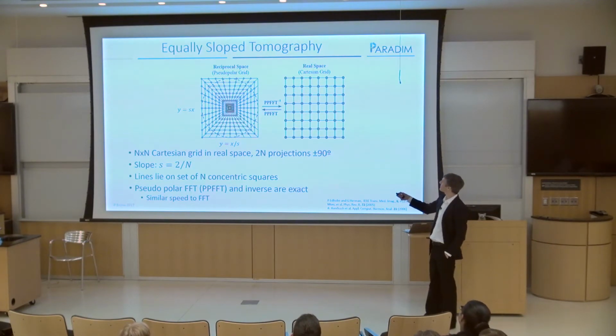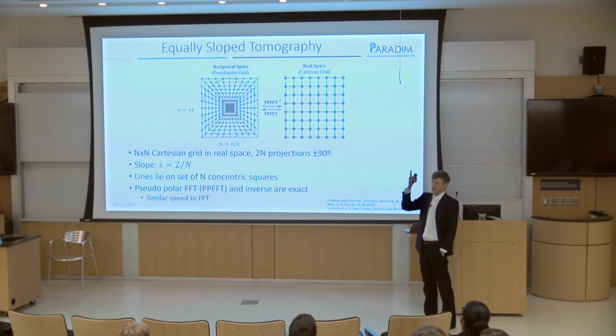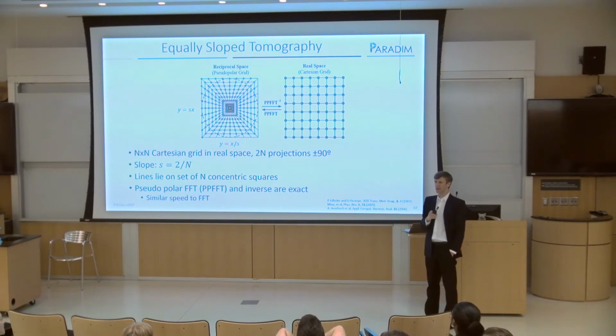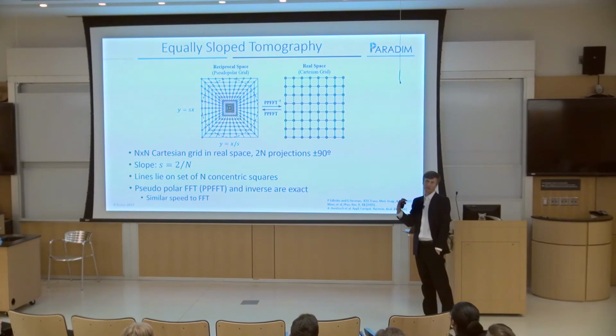So reciprocal space, remember we were taking our images at equal angle increments: 0 degrees, 1 degree, 2 degrees, 3 degrees, 4 degrees, right? But we don't have to take our projections on that. We can make our goniometer go to any projection angle that we want. So why are we doing that, right?